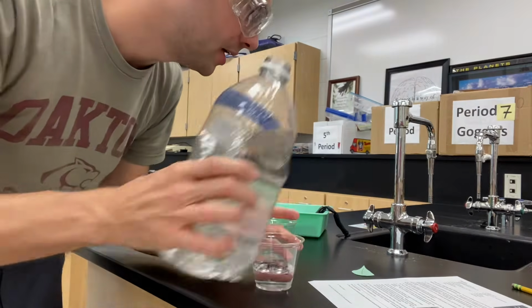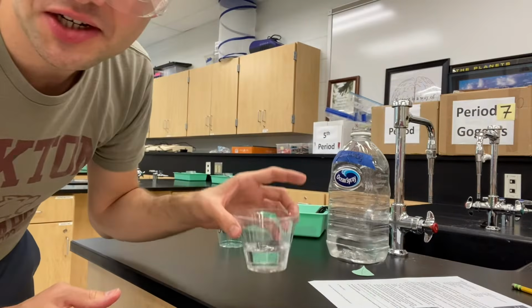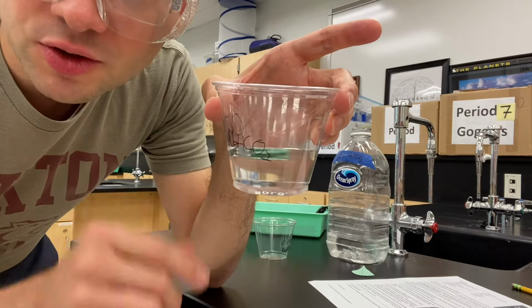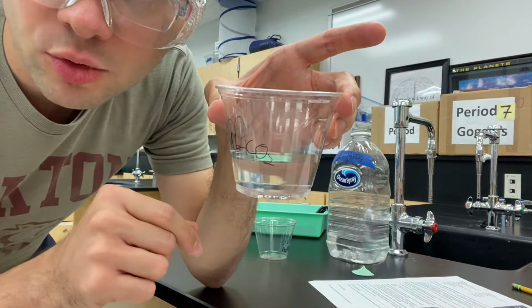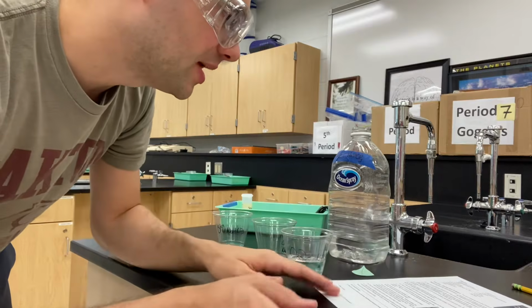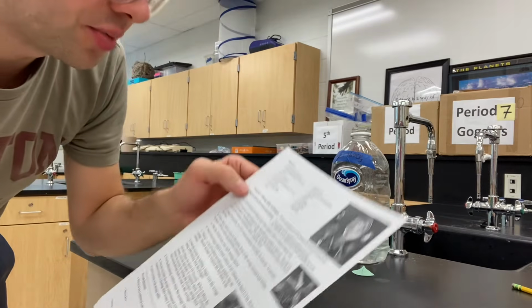We are not going to measure this necessarily. Just go ahead and eyeball it. You want about 200 milliliters. It gets you about 3 centimeters worth. I'd say no more than that. What I have in the cup is plenty. And that's step 1 in your procedure.